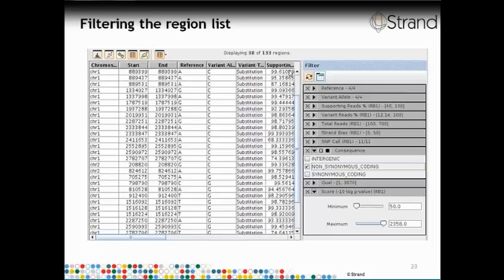We can even invoke the Avadis NGS SNP caller. We can find out commonalities between the SNPs called by Avadis NGS and the SNPs called by the MiSeq run. We can create filtered SNP lists based on different filtering criteria. We can look at the variants in the Genome Browser and assess their significance, etc. In addition, if people are interested, they can directly import the FASTQ file into an alignment experiment, and carry out the alignment itself within Avadis NGS before doing the downstream analysis.